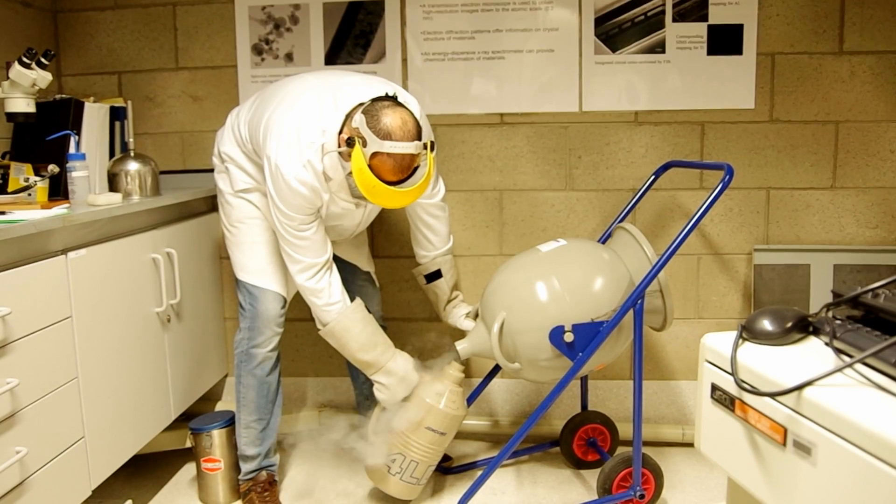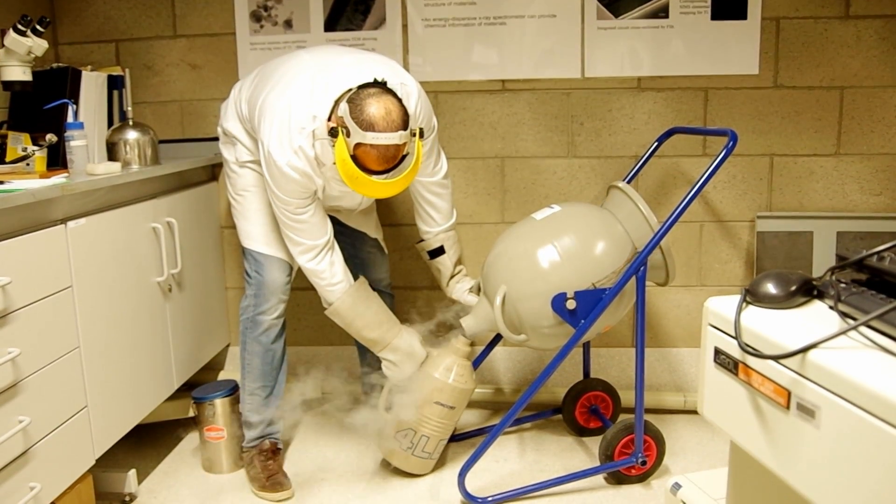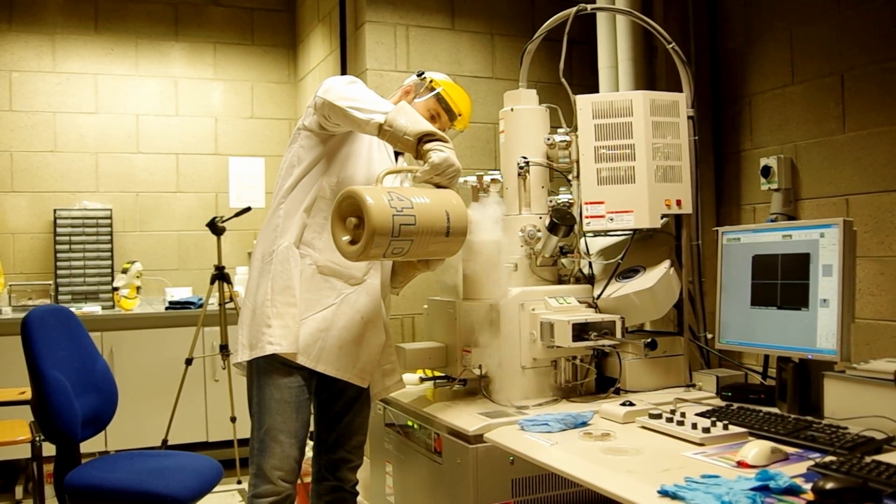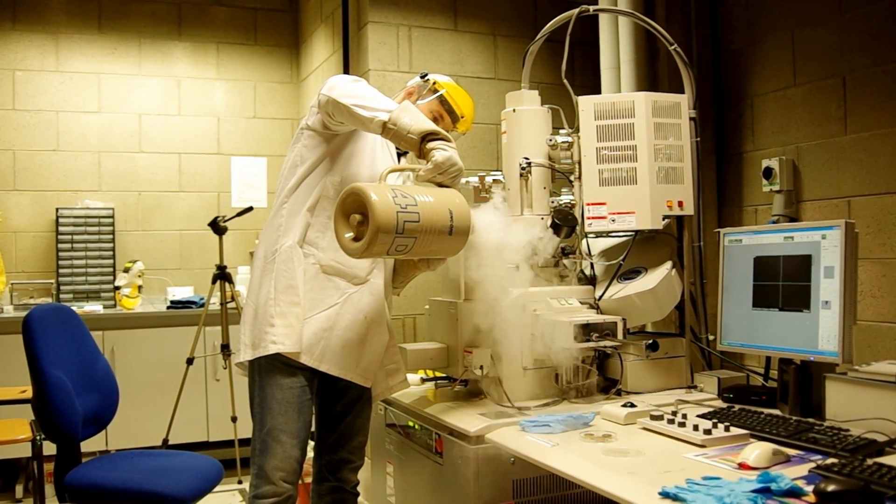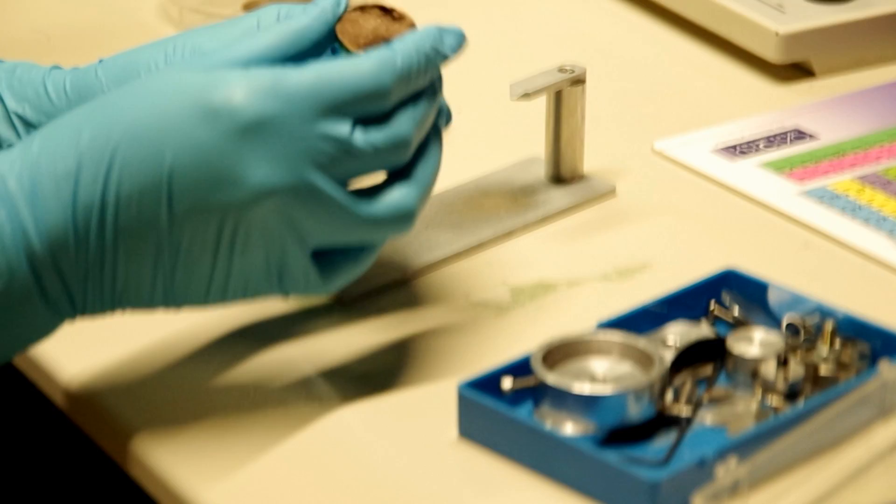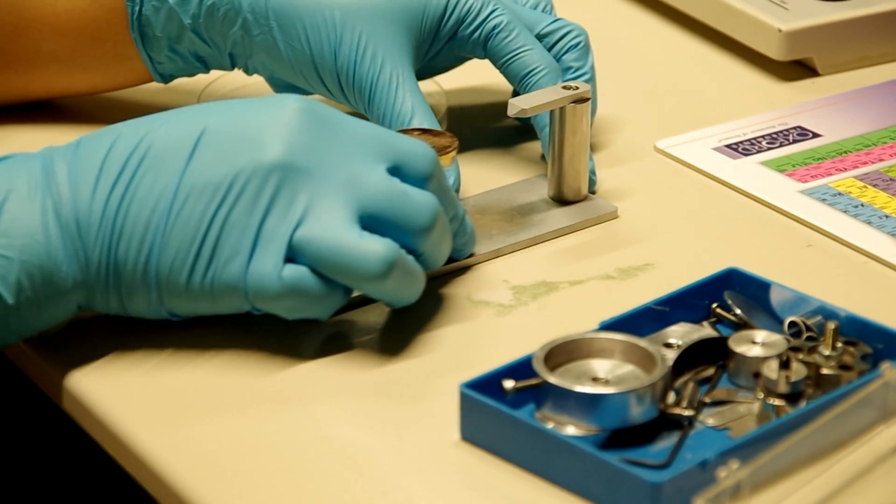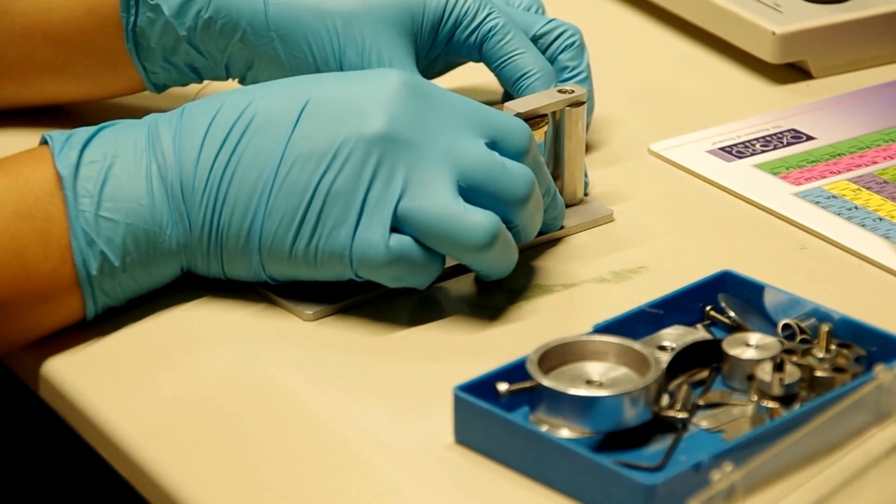Liquid nitrogen is refilled and poured into the liquid nitrogen chamber to cool down the detector, as to reduce the background noise detected. The specimen is screwed onto the sample base and measured with sample gauge to ensure the sample height is standard.